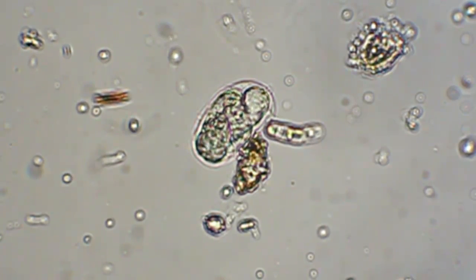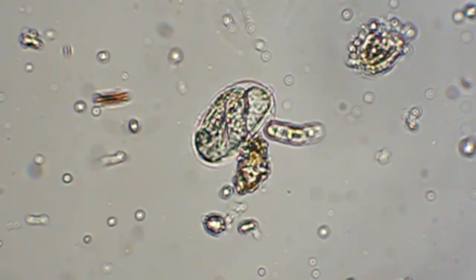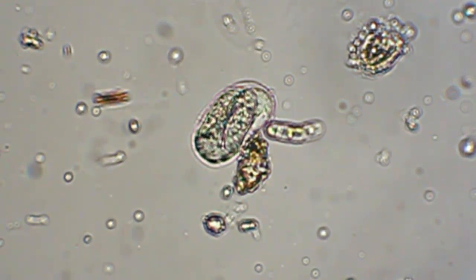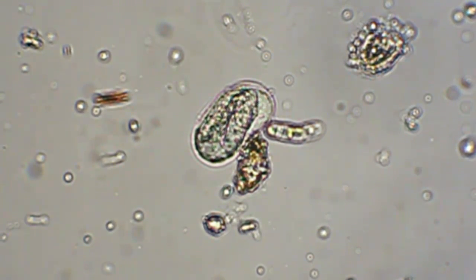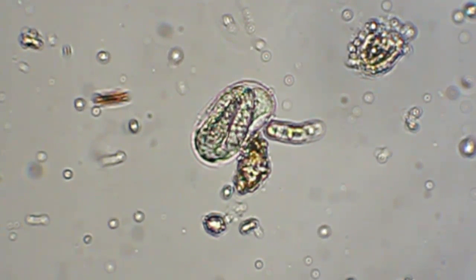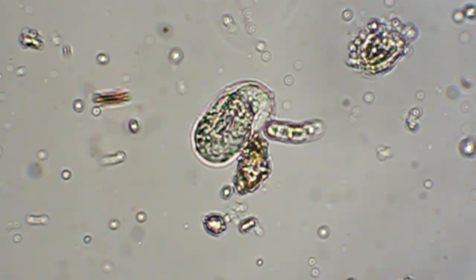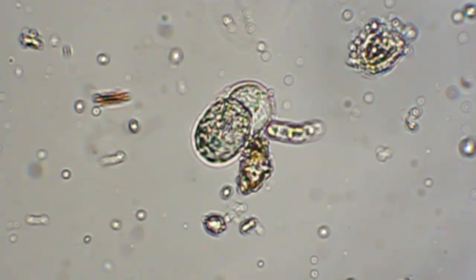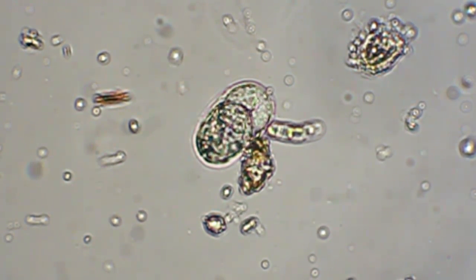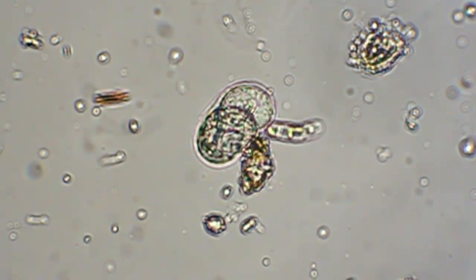What this is — it came out of a sample of some kind of dried fungus I found on the side of a dead tree laying in the woods. I put it in a petri dish and then soaked it for a few days in water. This is a couple drops of water that I used to pipette to pick up from the petri dish and put on a depression slide.